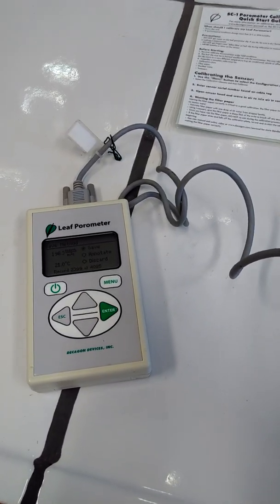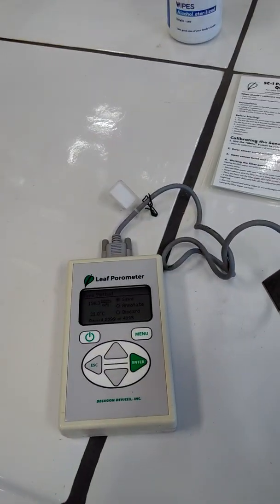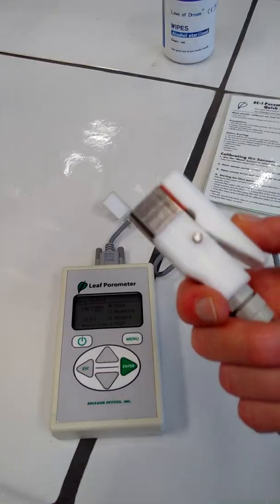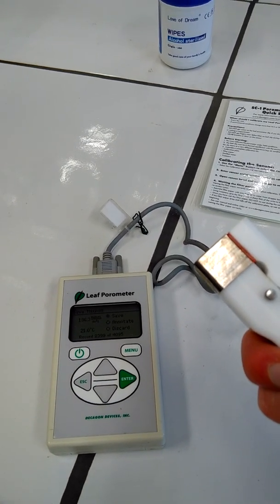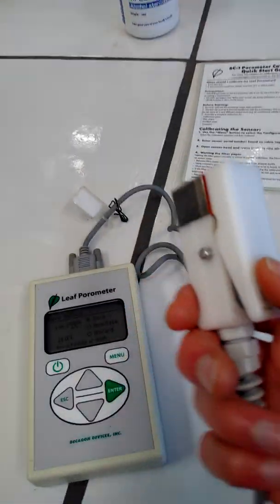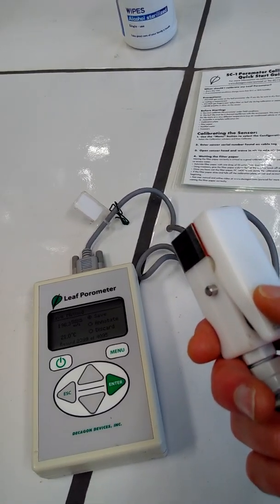But so the principle is just, you put it on a leaf, and you will see, I think it's 2 minutes. You need to wait for 2 minutes. Water is diffusing into the chamber, and then in the end, it gives an idea. Internally it's just seeing a slope, and then it calculates a rate which is translated to a stomatal conductance.